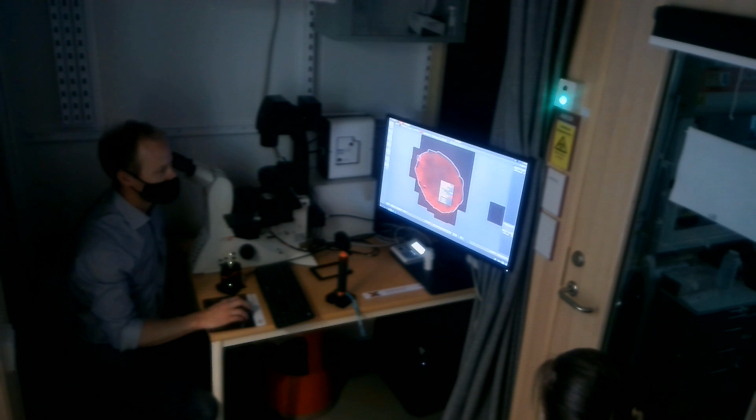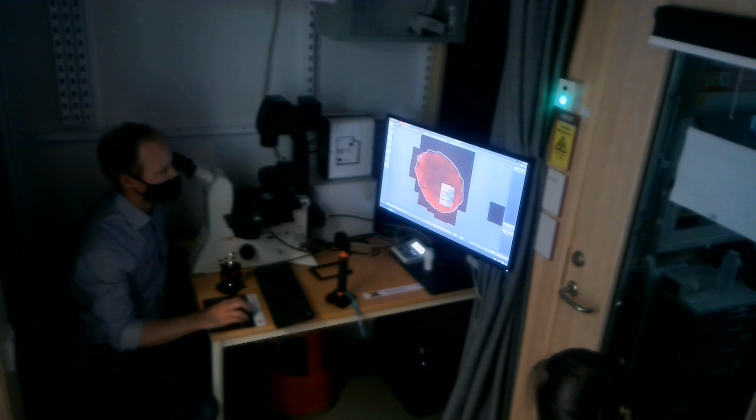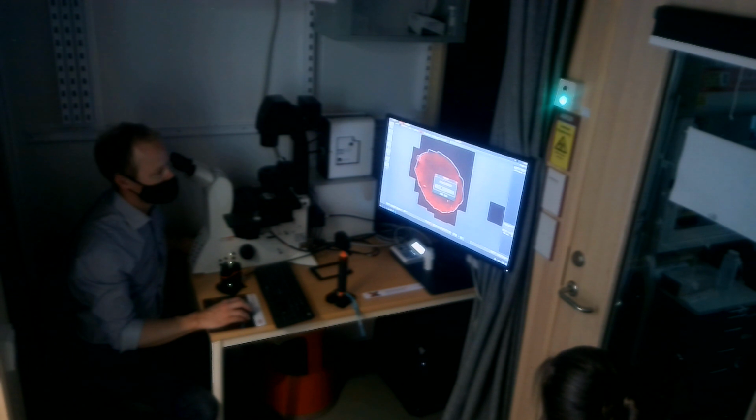You can say that this tool is actually new. So that part doesn't seem to be working well. But this is the point that I wanted to show. To randomly put positions within a region of interest, you can also take and put multi-position. So that's in the setup region. And in there, let's see if this setup focus point will be better. That was also right below, it's setup focus points.